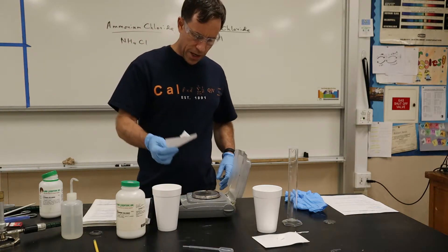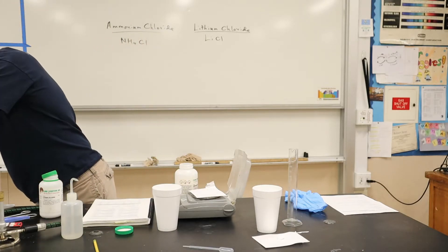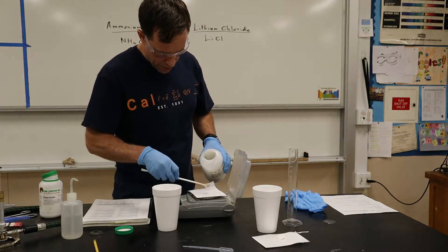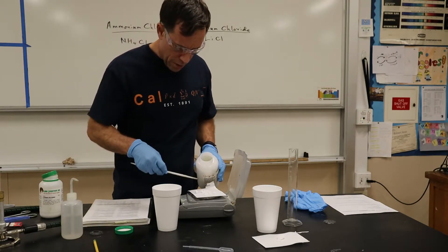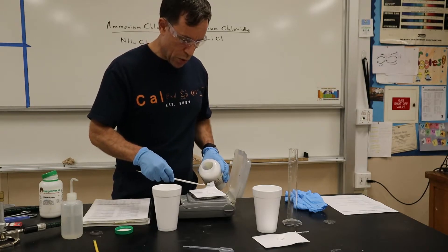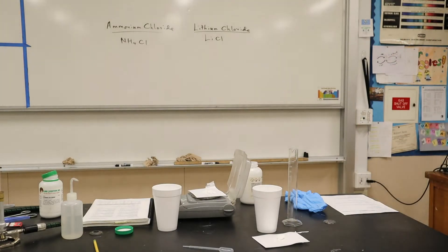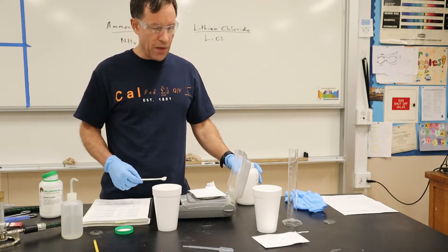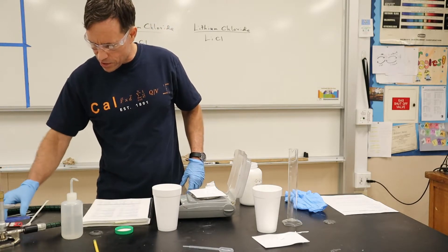I'll put my weighing paper on the scale and zero it, then use ammonium chloride. We need about five grams of this. A little bit too much, so I'll put some back — we got about 4.92, then 5.06. So we got roughly about 5.06 grams. It's pretty close to five; it doesn't have to be exactly five, just relatively close.